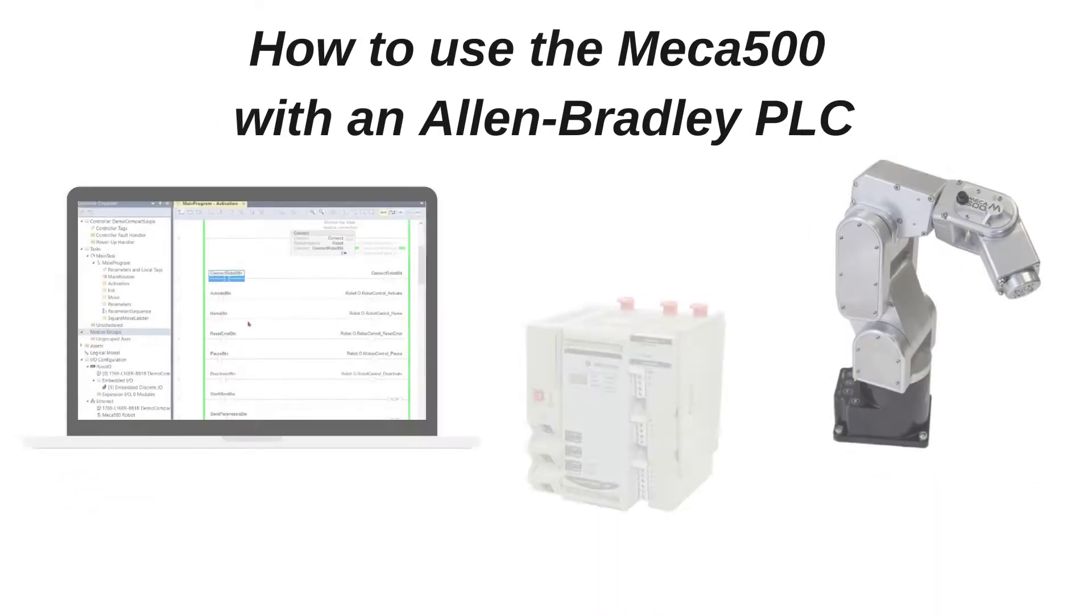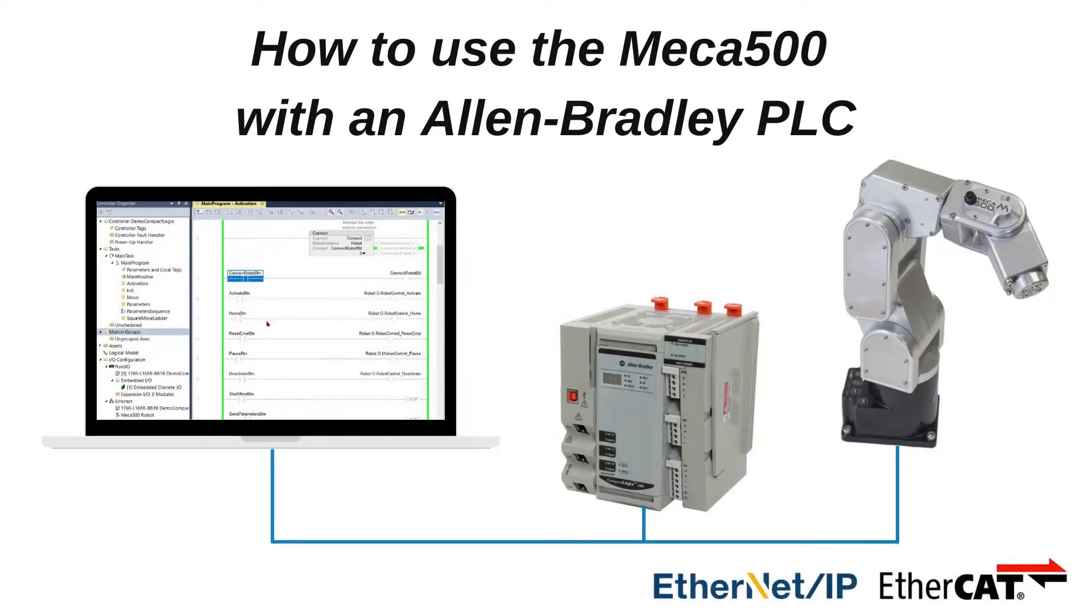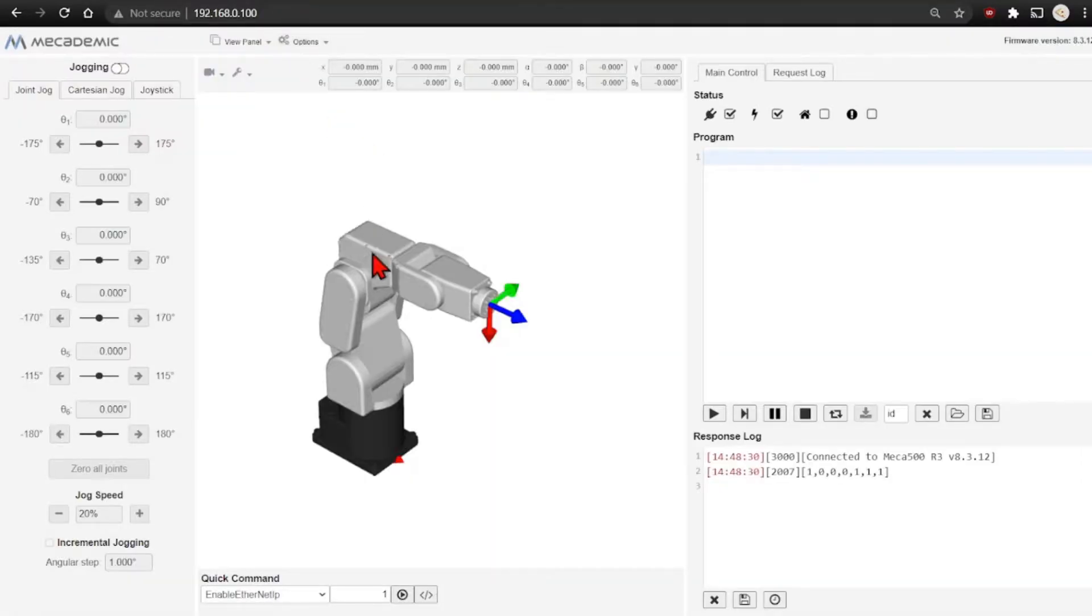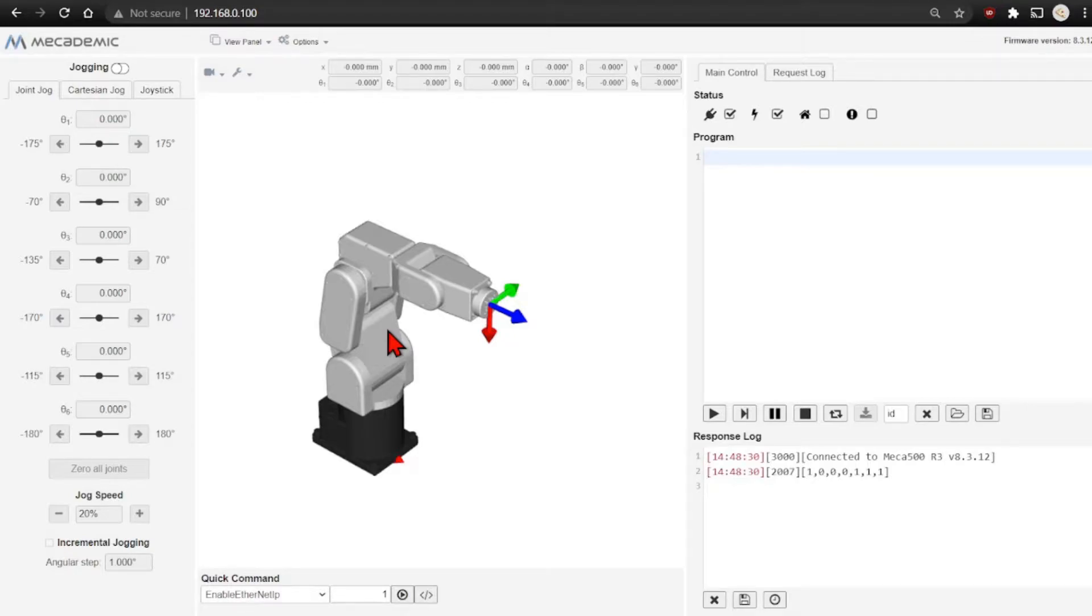Now we'll show how it can be used with an Allen Bradley PLC. The EDS files can be found on the firmware page of the MECADEMIC website. The EtherNet/IP mode must be enabled one time; this can be done in the web page. This setting will stay enabled even after a power cycle.